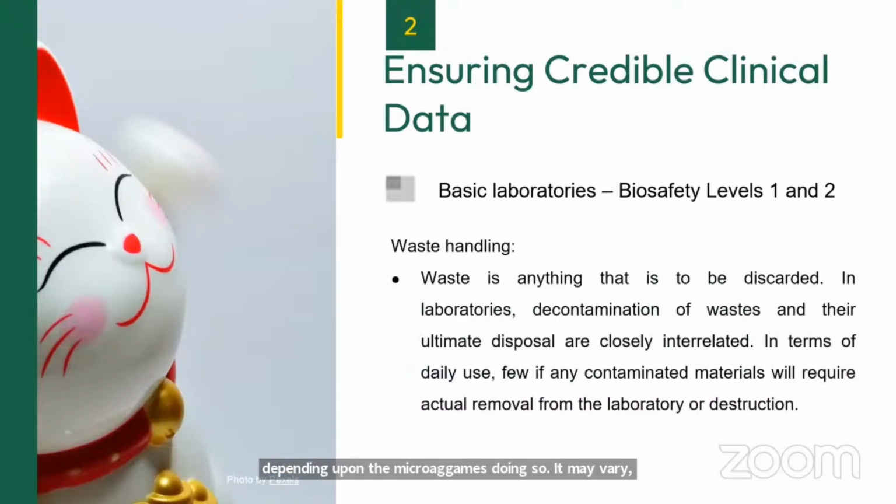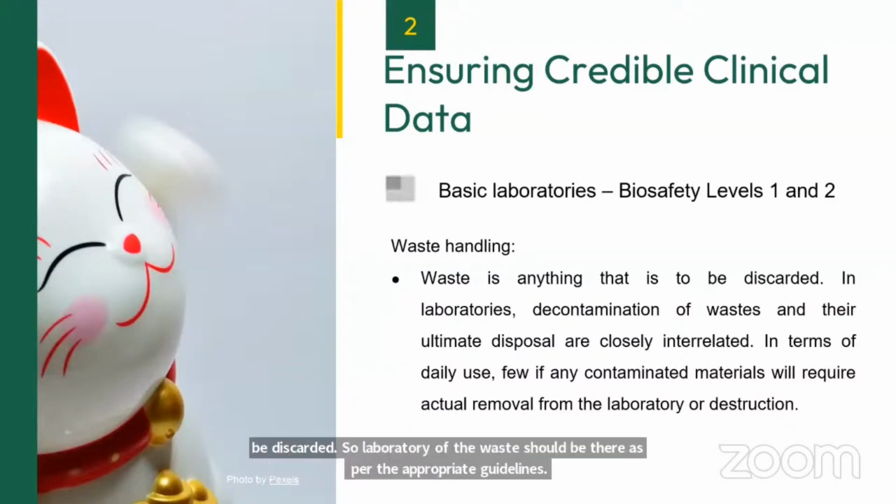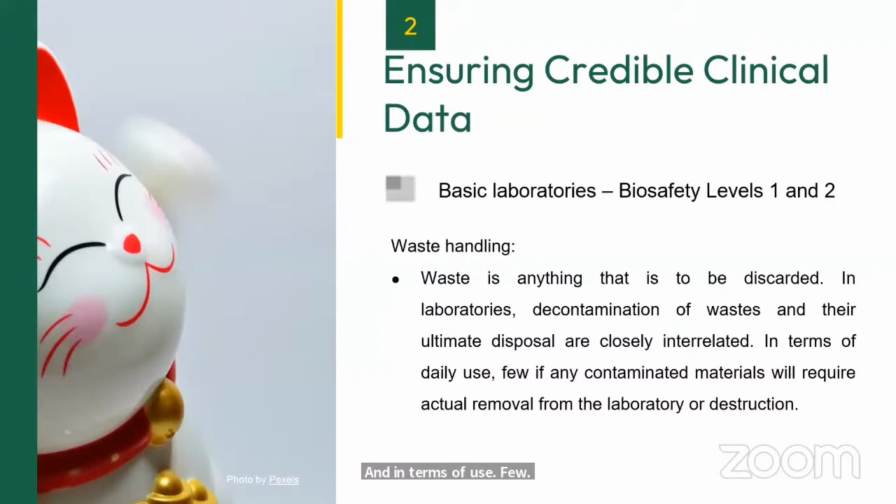Waste handling: waste is anything that is considered to be discarded. So laboratory decontamination of the waste should be done as per the appropriate guidelines. And in terms of daily use, few if any contaminated materials will require actual removal from the laboratory or destruction. So you may need to remove some materials from your laboratory as part of the discarding facility.